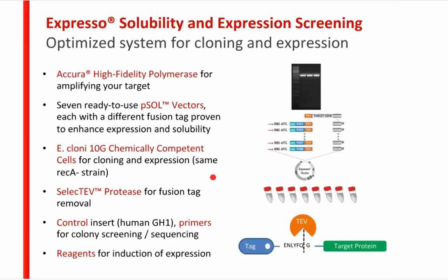We also include a RecA- strain of E. coli. And in this system, the same strain is used for both cloning and expression. And then there's a protease for removal of the fusion tag.